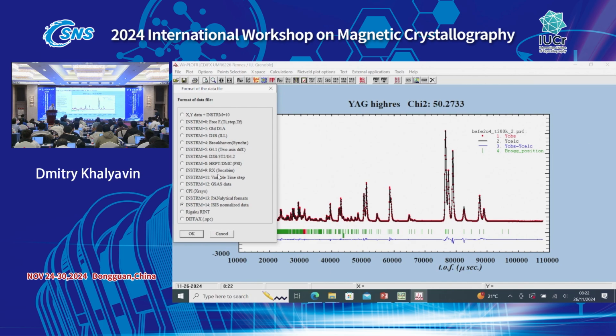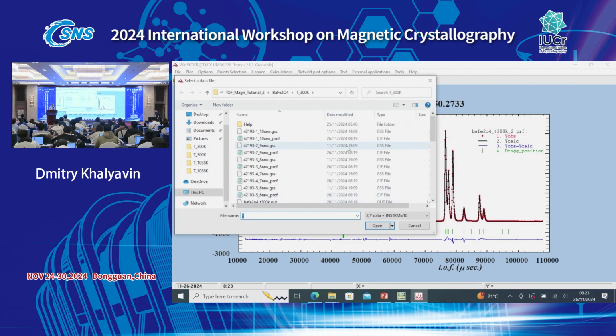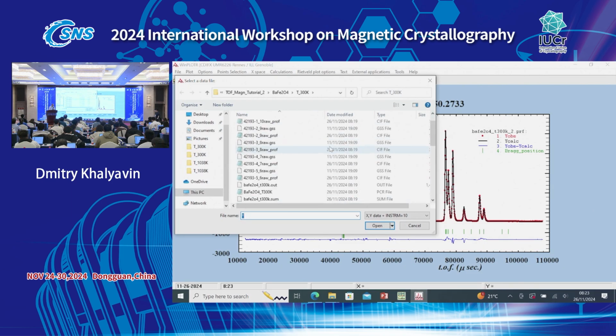No, I've never seen. It's just the first one. Instrument number 10. Yes. This one? Yes, open. No, it has not been. Yeah, well, you have a yes. Go down. No, this is not the summary. No, there is no sub.